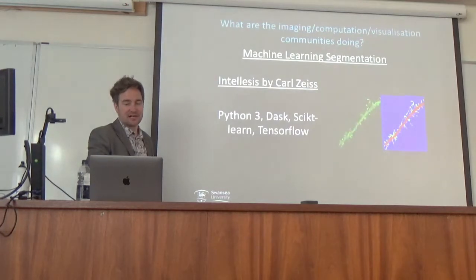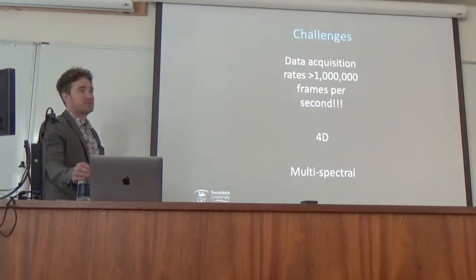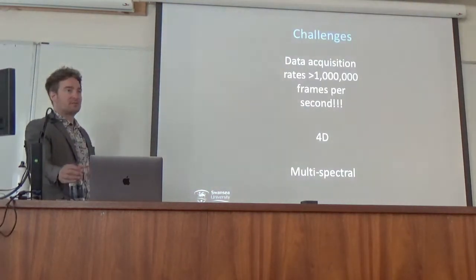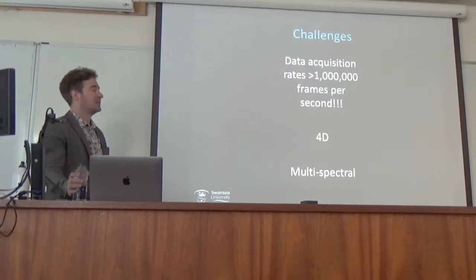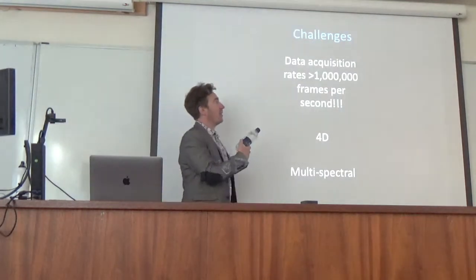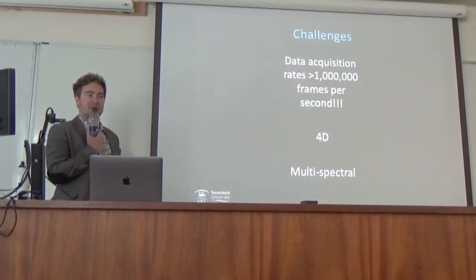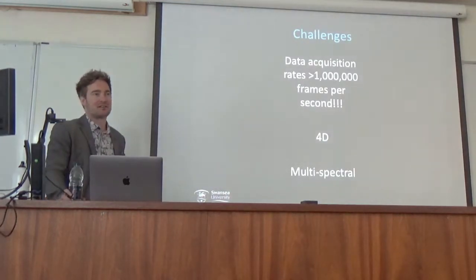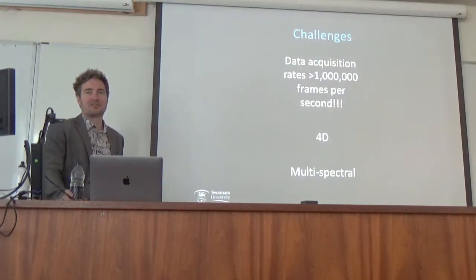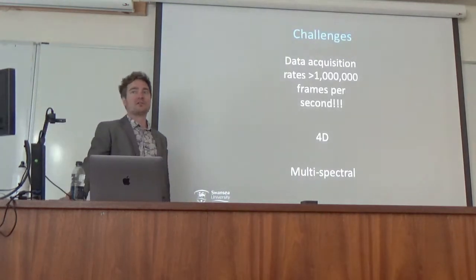The next slide talks about some challenges. So I mentioned X-ray is what I'm really focused on, and 3D data. Here are some challenges, and this was brought up earlier this week: acquisition rates for X-ray data at synchrotrons, or ESRF, which is the synchrotron in Europe. You can get over 1 million frames per second now. And that just blows my mind in terms of the volume of data that's going to be collected. Is anyone ever going to be able to look at that? We were talking over lunch yesterday about people with hard drives on their shelves that they're going to struggle to ever get the time to analyze. So automated methods are becoming more and more important.